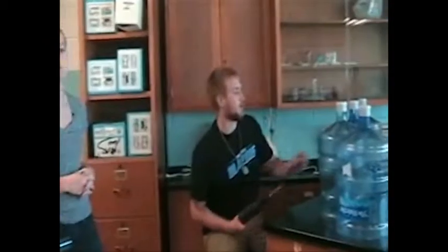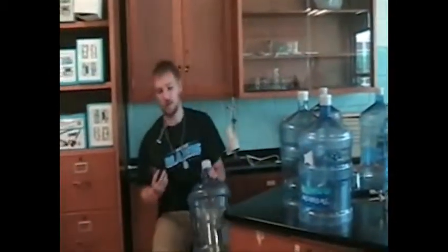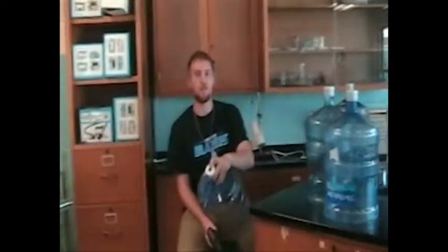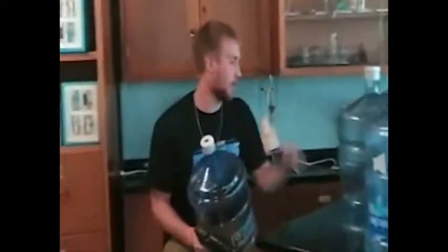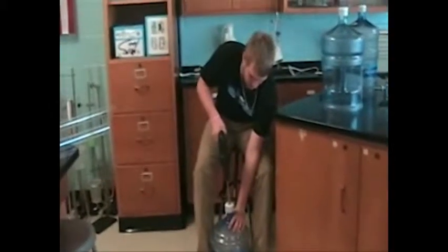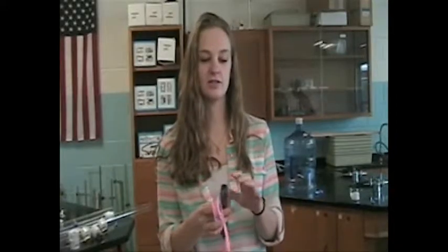The next step in making this is you're going to take a 13/16 drill, and you're going to drill a hole through the top of the cap so that you can put in a 1/2 inch by 5 inch threaded nipple. Plumber's tape creates a tighter seal around the threaded 1/2 inch by 5 inch nipple.